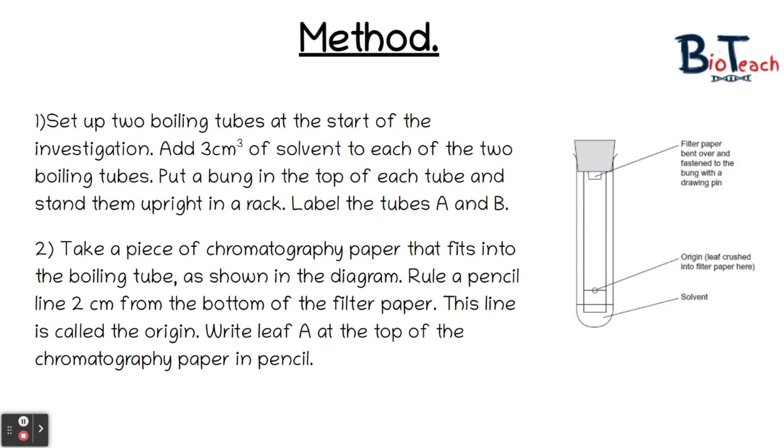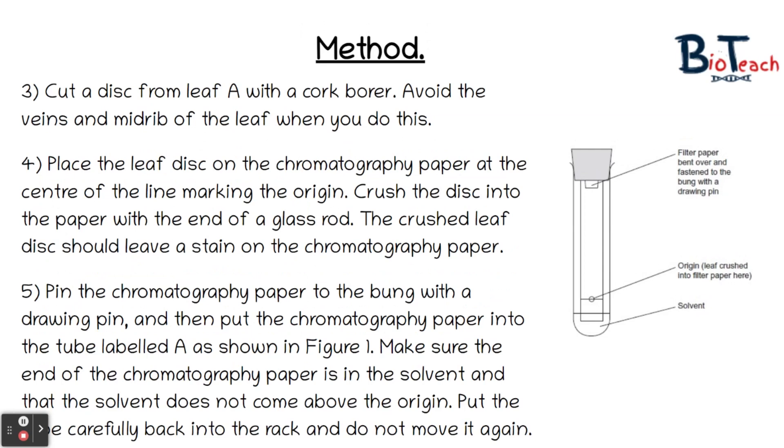You will take a piece of chromatography paper that fits into the boiling tube. Usually this will be cut for you by the teachers or the technicians, but you may need to cut it yourself. You will rule a pencil line about two centimetres from the bottom of the filter paper. This line is called the origin line. At the top of the chromatography paper in pencil you will write leaf A. You will do the same for the second leaf as well.